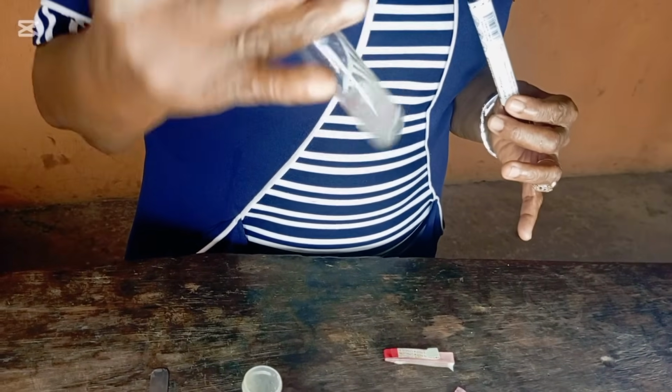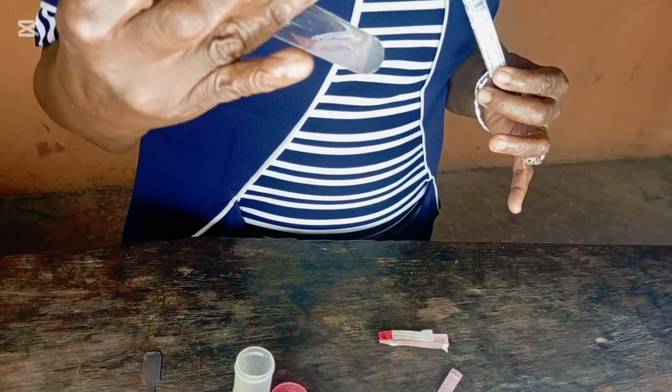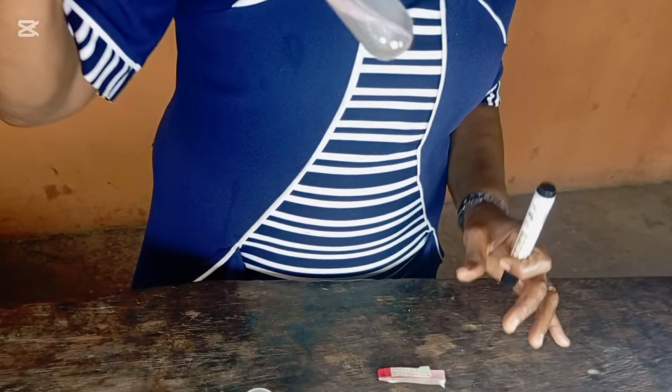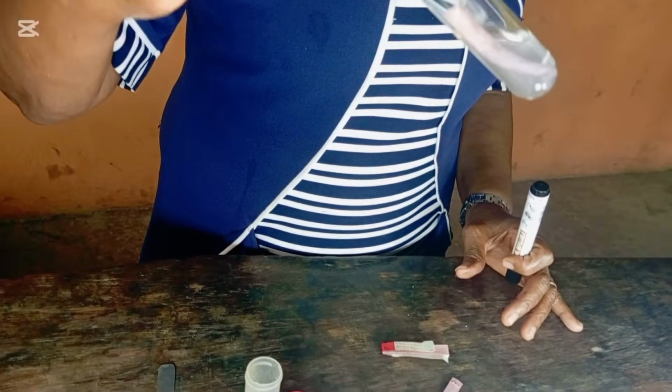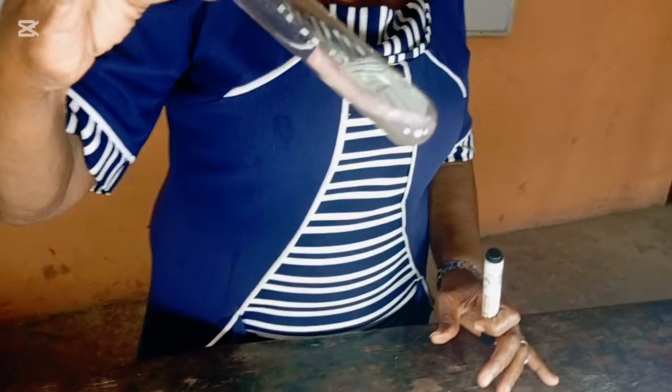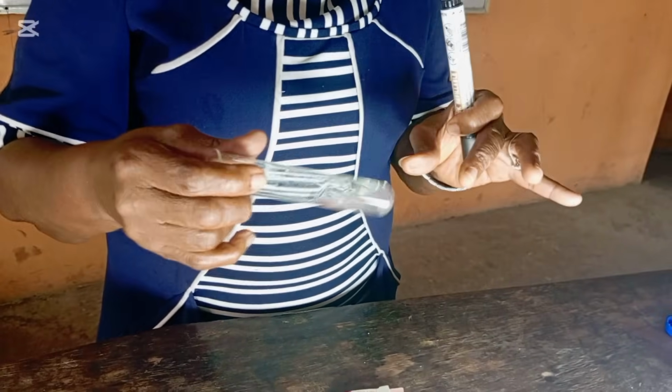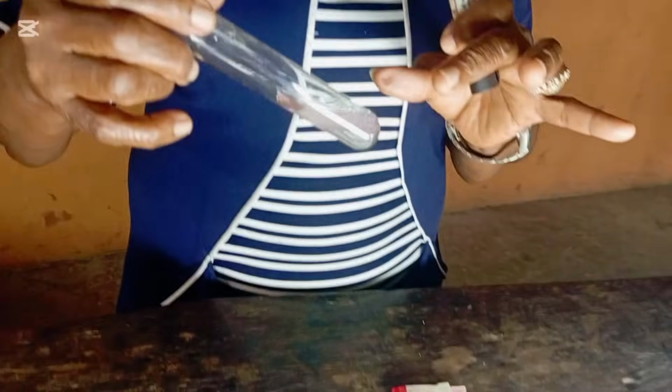It will turn the red to what? Blue. It will turn it to blue. You can see that it's turning it to blue. If you leave it after some time, you see the real blue.